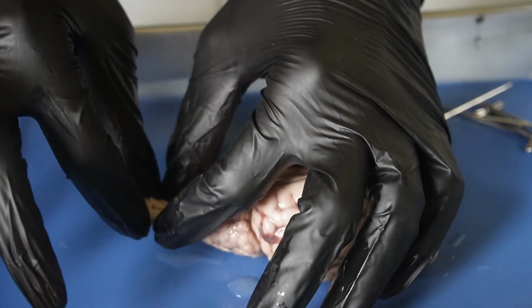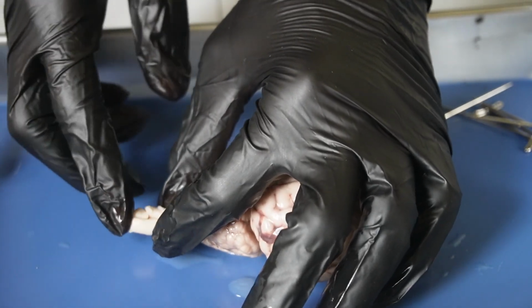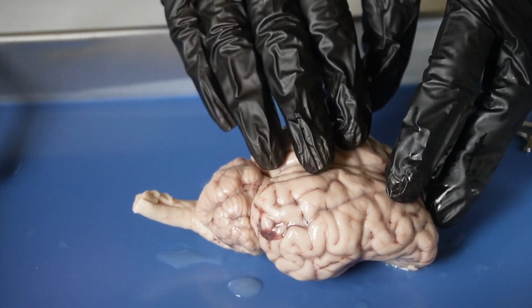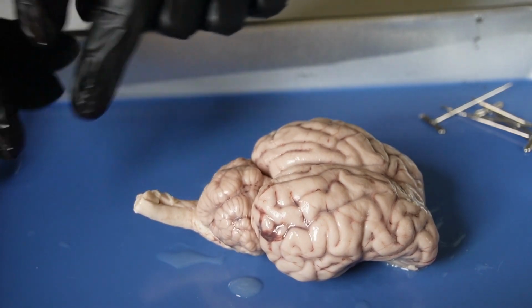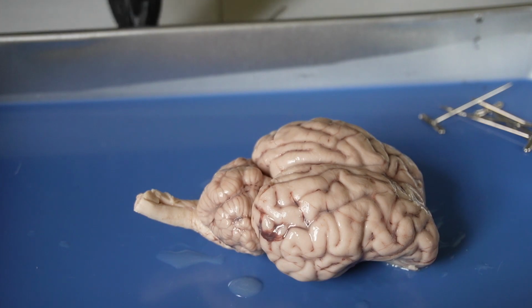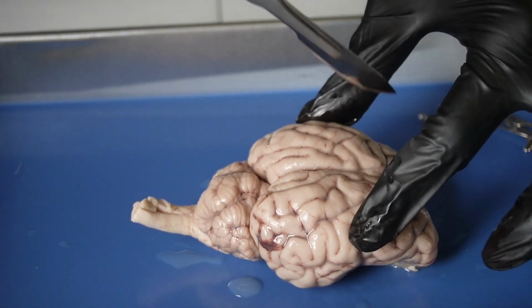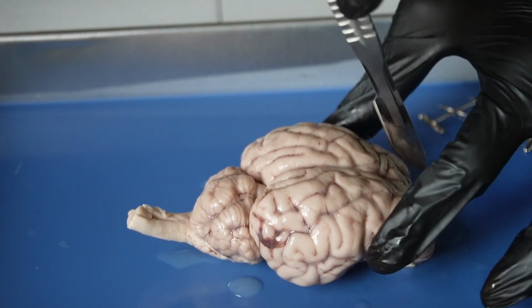The spinal cord essentially sends messages from the brain to the rest of our body. So now I will make a sagittal cut here.